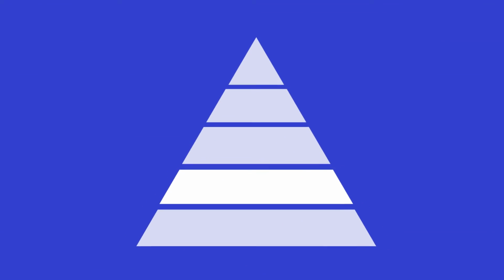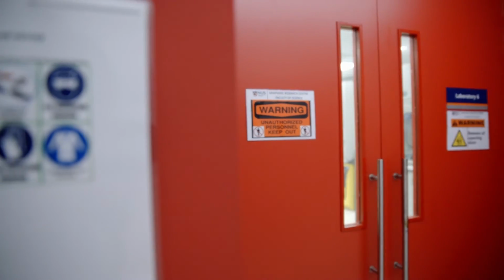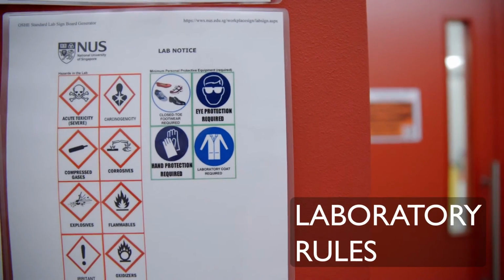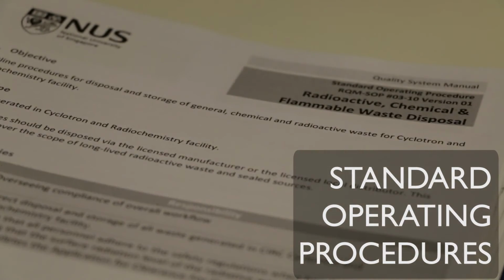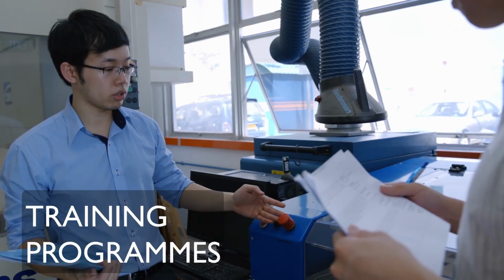Next on the hierarchy of control are administrative controls. Examples of administrative controls are laboratory rules, standard operating procedures, emergency procedures, and training programs.